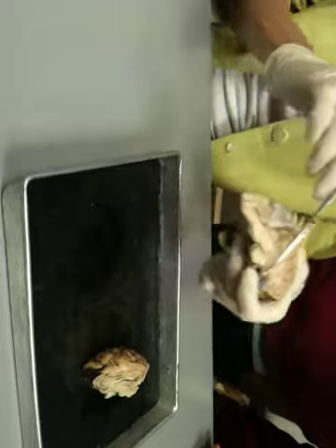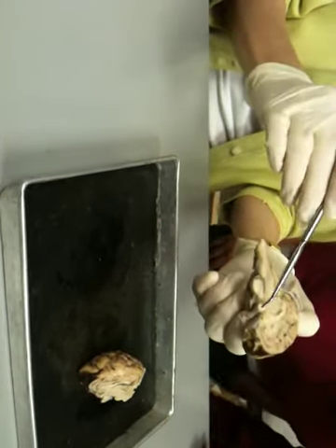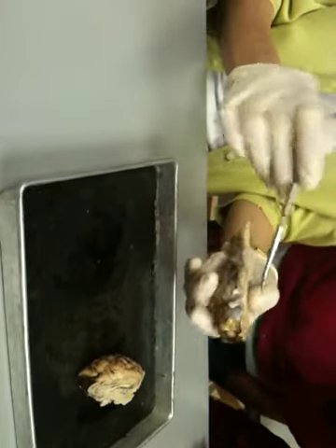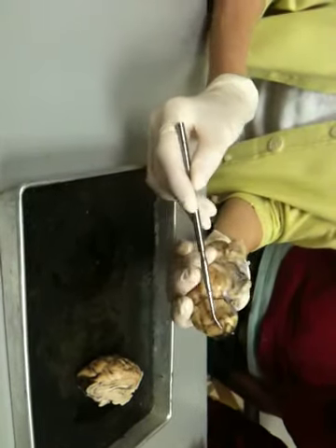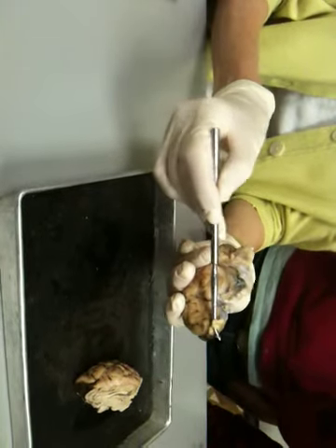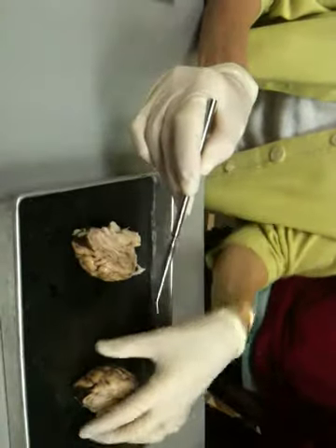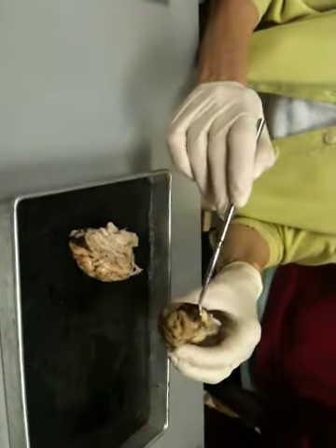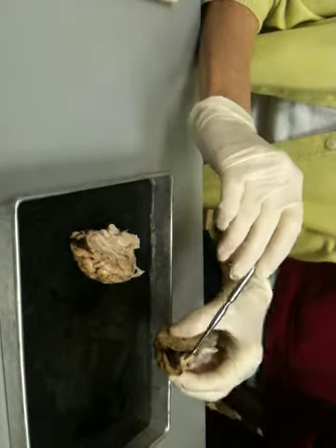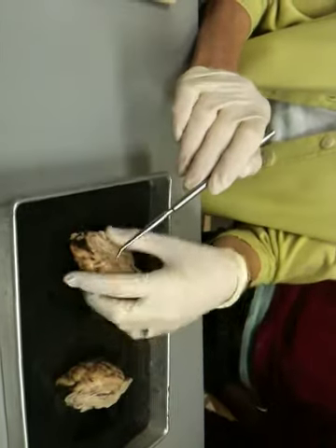Just anterior to that, this thing is the optic chiasm. You can say chiasma or chiasm either way. Okay, this thing here that's usually torn, like this one, is the olfactory bulb. This is really delicate tissue, so it's often torn, but it's actually pretty big in the sheep. It's bigger than it is in humans because they rely more on smell than we do.